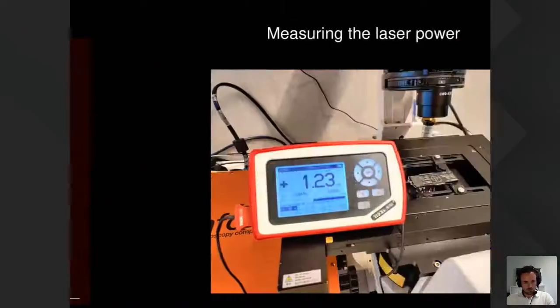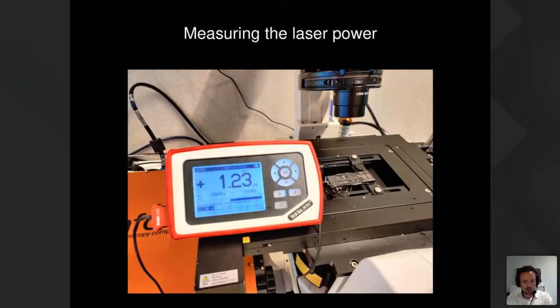So we also measure the excitation light. This is something that we would also highly recommend people to do when doing live cell imaging. And for this specific experiment with 61 hours of imaging, we used 1 microwatt of exposure at the sample surface, so after the objective, at 561. So that's very, very little laser light. It's actually about 10 to 20 times lower than you would use in a regular confocal.